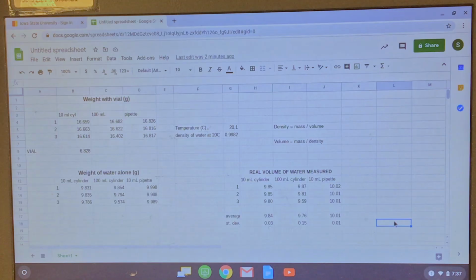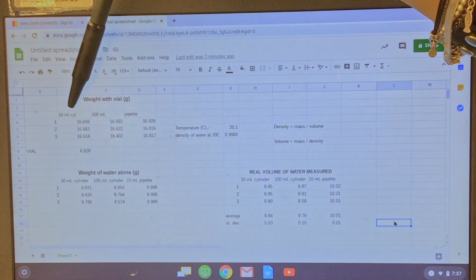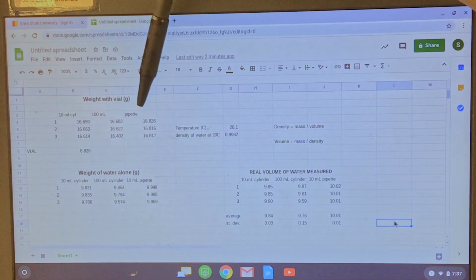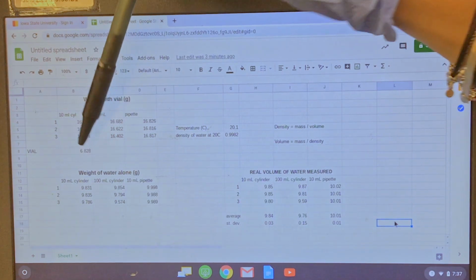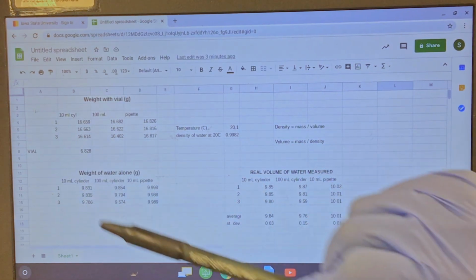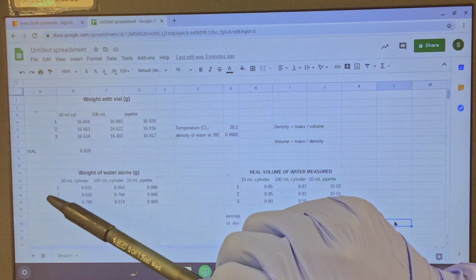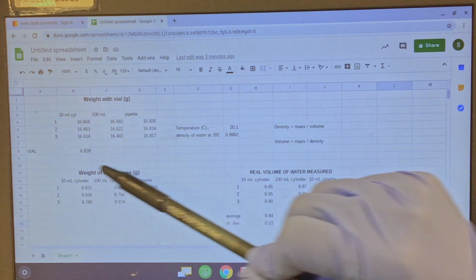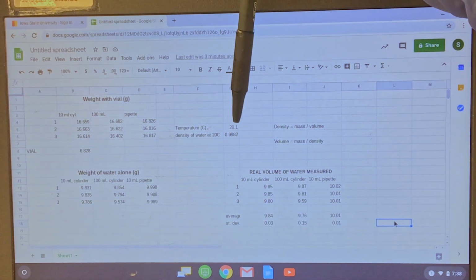Okay, so now I reported all my data on the computer. So here I reported all the measurements that I made with the vial for the 10 milliliter graduated cylinder, 100 milliliter graduated cylinder, and 10 milliliter graduated pipette. Then this was the mass of the vial, so I subtracted the mass of the vial from this to get the weight of the water that I measured, okay? So this is the weight of the water alone for the 1, 2, 3 trials with the 3 pieces of glassware. Now, when I measured the temperature of the water, that turned out to be 20.1 degrees Celsius.